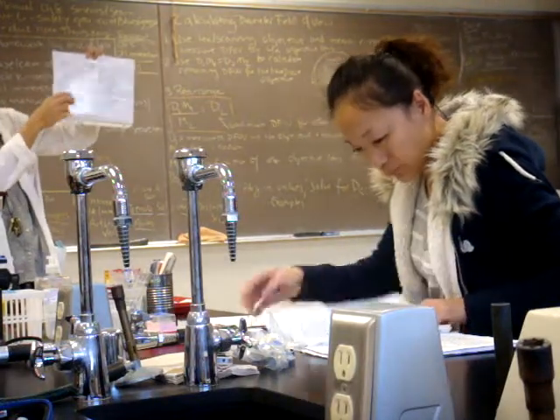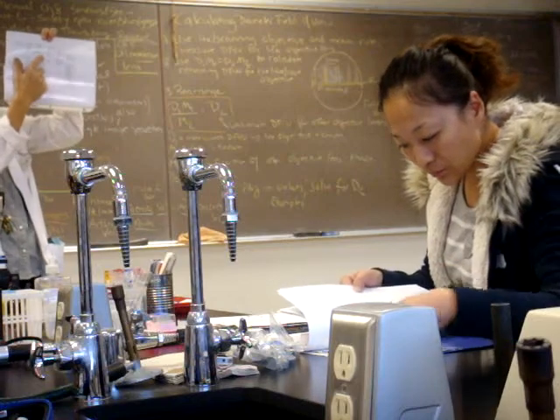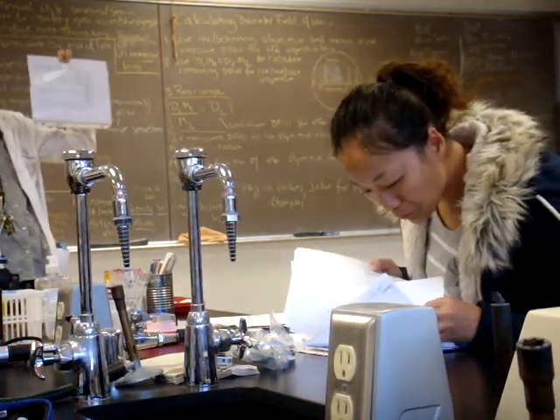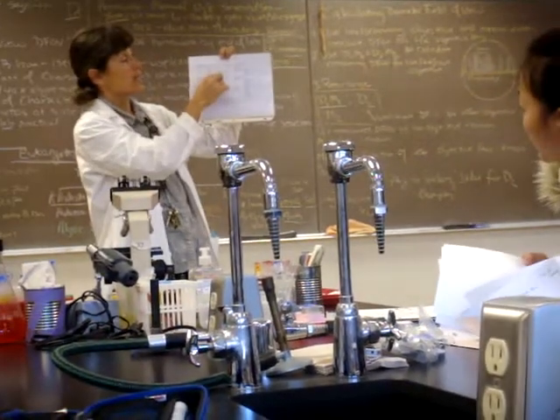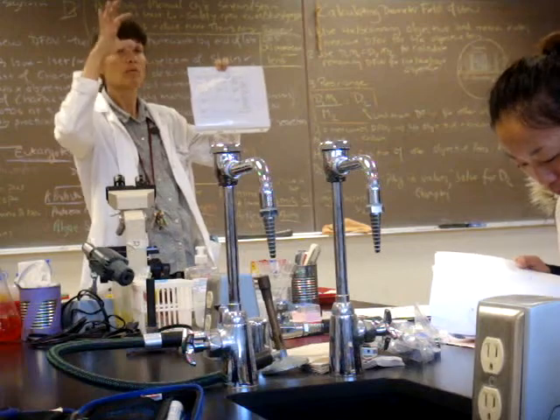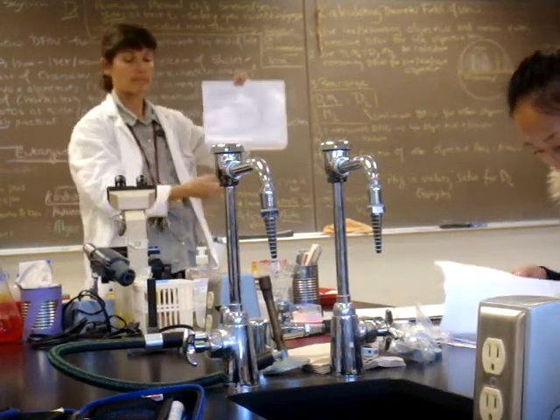That might be useful to download. And it has a cartoon of what happens to the diameter of the field of view and the diameter of the lens of the objective lenses as we go from low power to higher power. The diameter of the lens itself decreases, and thus the diameter of the field of view decreases.